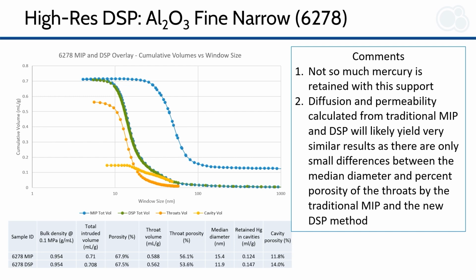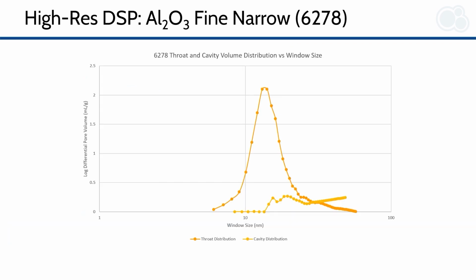The log differential graphs reflect the small proportion of pore volume within cavities for this sample.